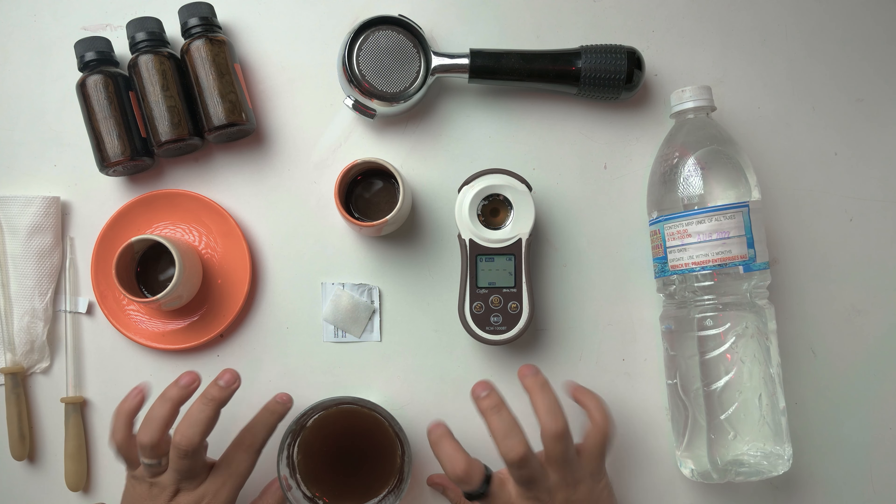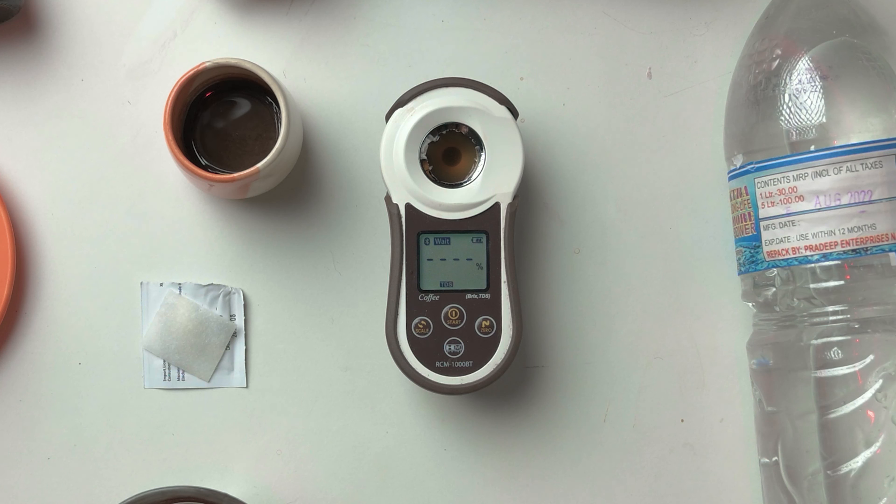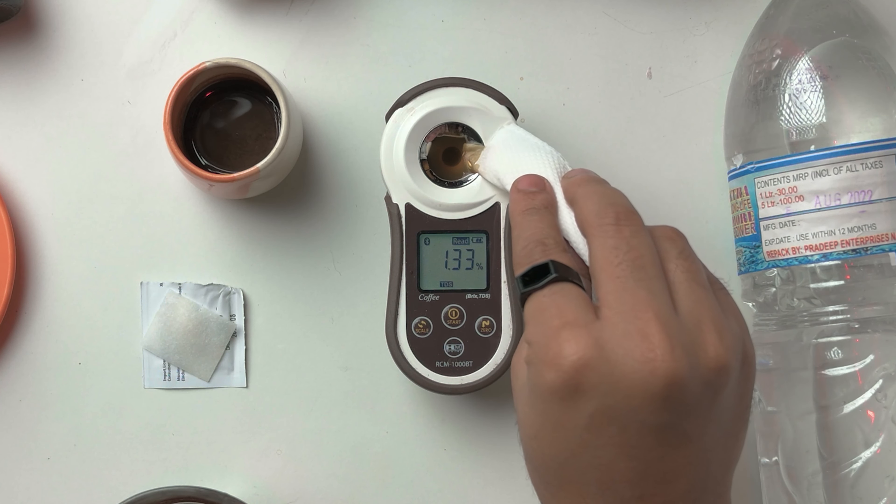Next, take a paper napkin, roll it a little, and by the edge of it carefully take away all the distilled water — don't wipe it too hard. Then take the alcohol swab again, rub the lens, and keep it aside.